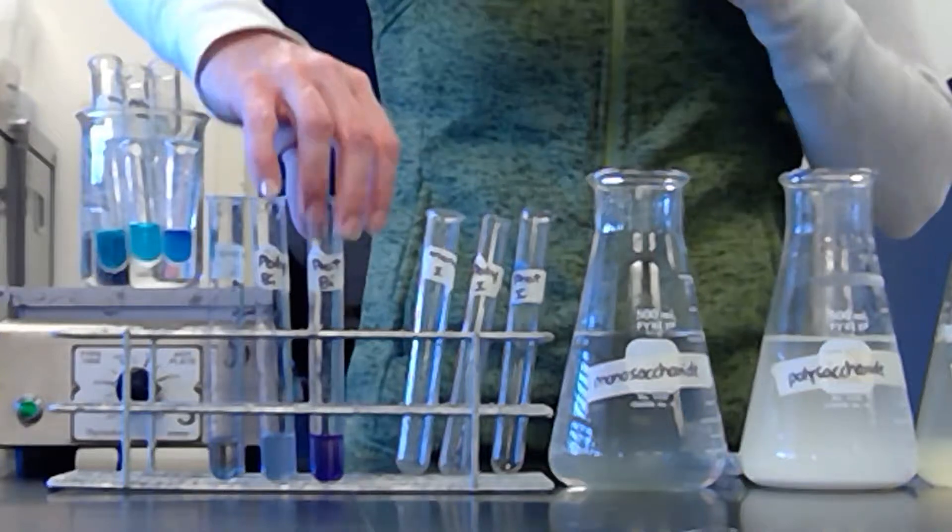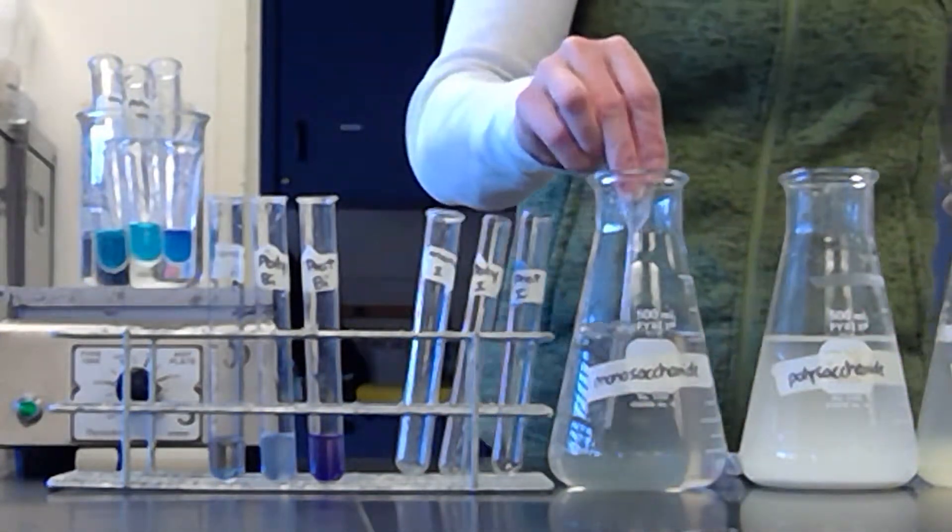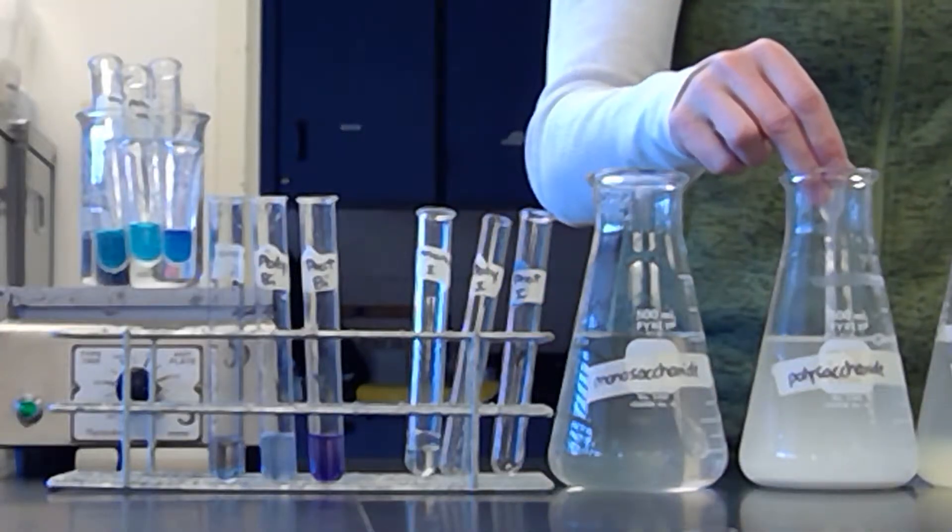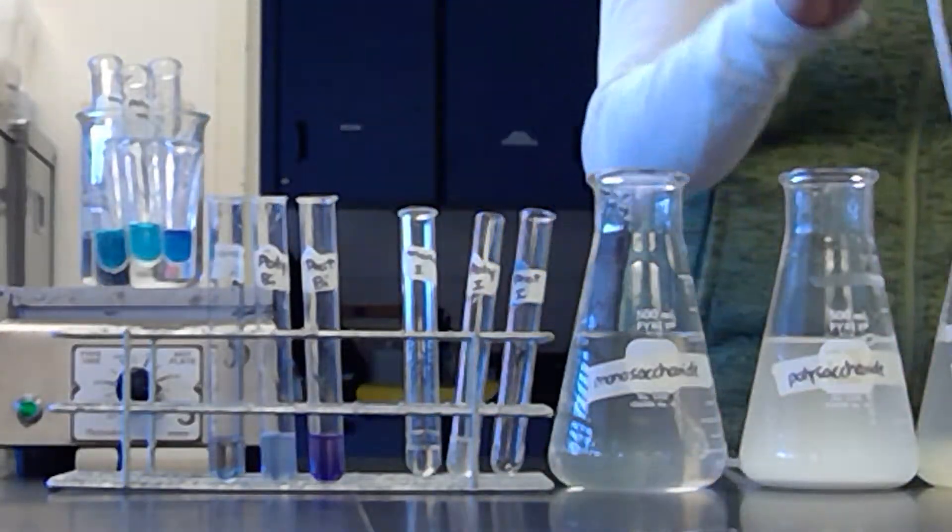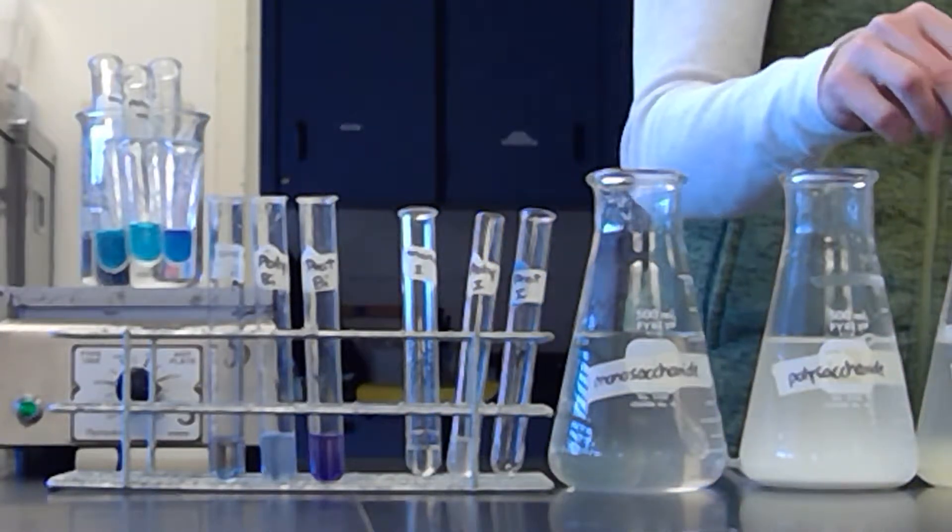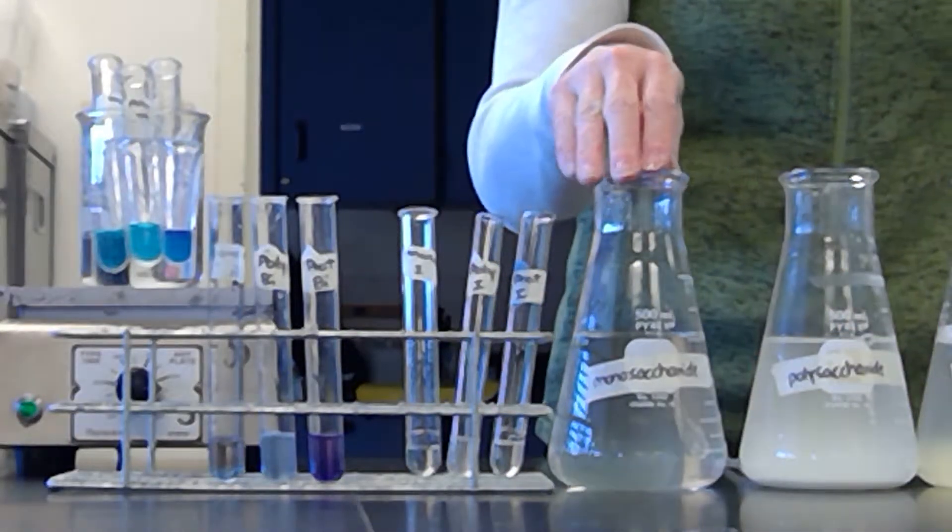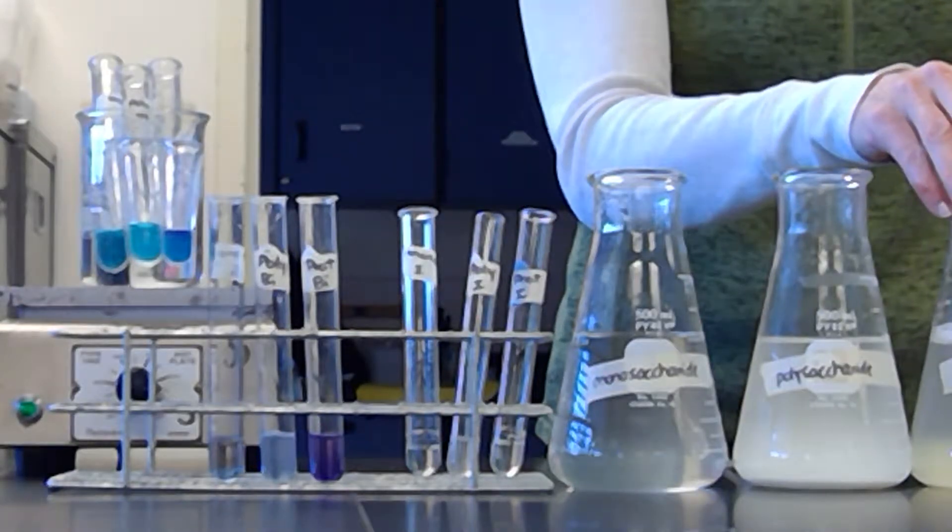And so the biuret, which is what these three tubes are, tests for protein because the tube, this protein is the one that came up positive. And so now we'll do iodine. We'll do a squirt of monosaccharides, a squirt of polysaccharides, and a squirt of proteins.